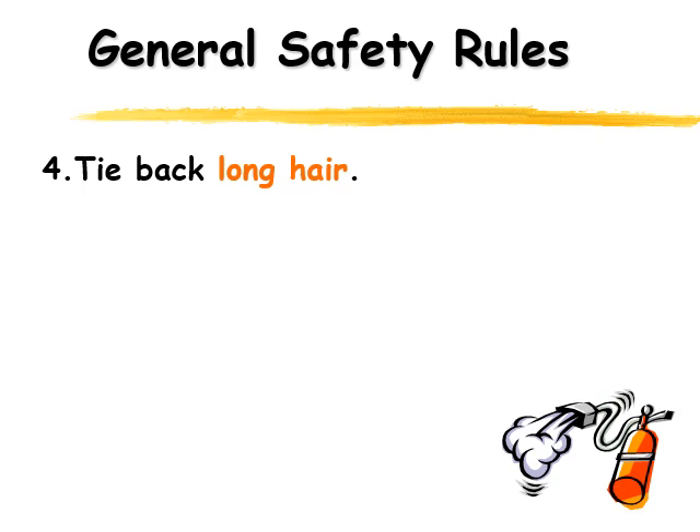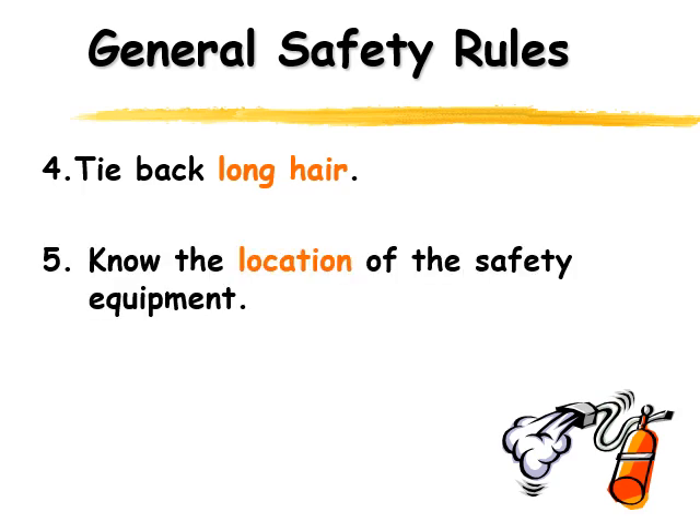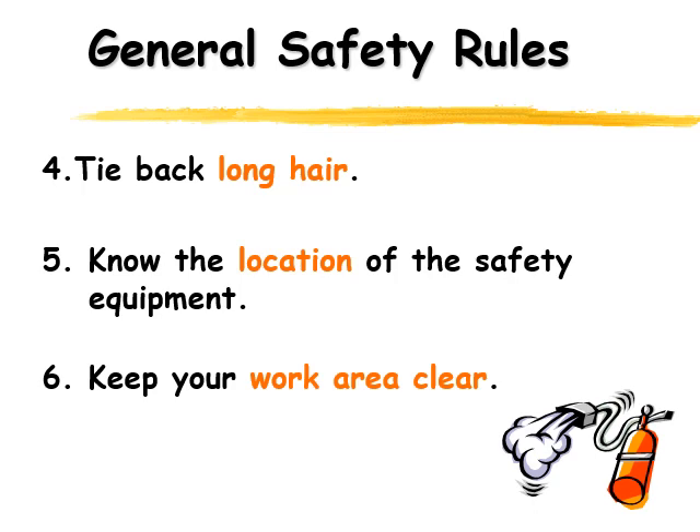The next thing you need to know is where all the safety equipment is. We're going to go through the safety equipment that's in the classroom, but make sure you know the location of all the safety equipment. If we were in the classroom, you'd have a chance to go around and see where these things are placed. When you're doing your labs, make sure you keep your work area clean — when it's cluttered and messy, that tends to cause more mistakes.